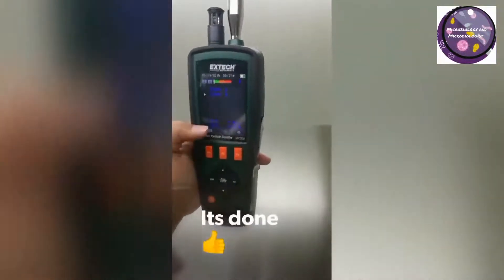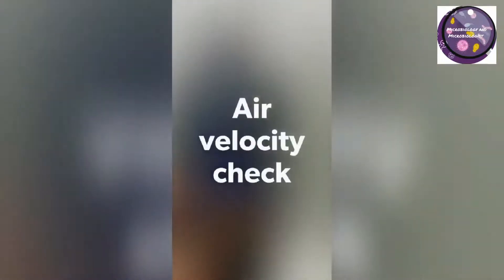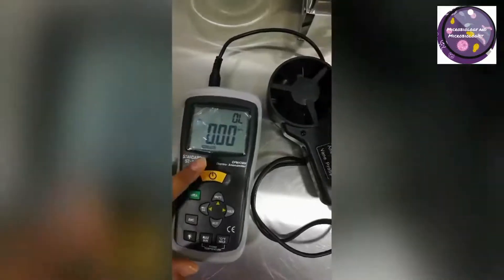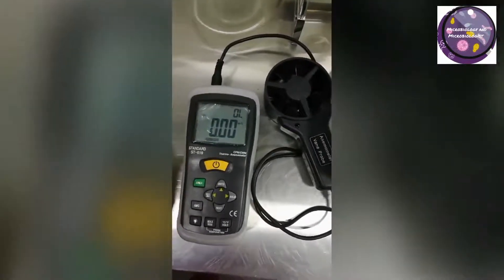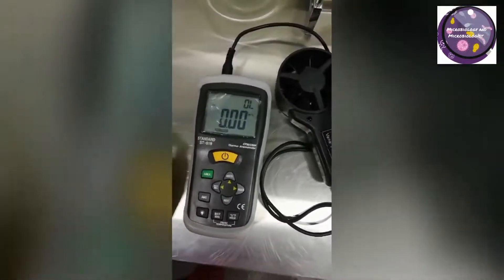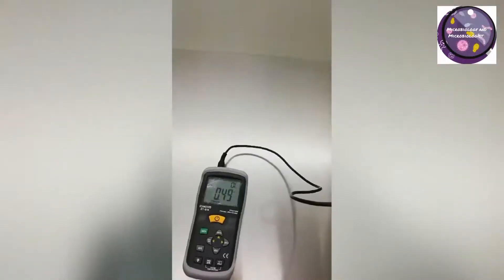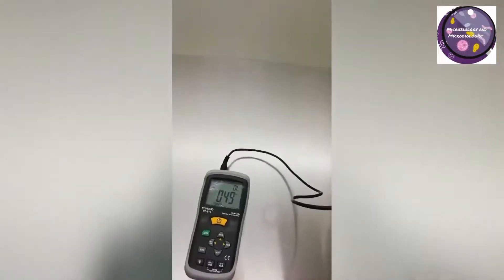That's done. We will now check the air velocity using the anemometer at different points of the laminar airflow hood. Its unit is set to meters per second. The limit is 0.5 meters per second plus or minus 20%. I am collecting air velocity readings from different points, and after that we will sum up and take the average of the results, which must be within the limit.